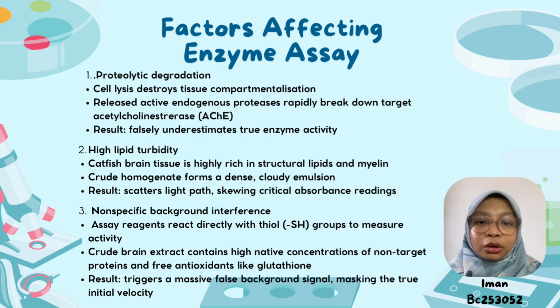First, we face proteolytic degradation. The moment we disrupt the catfish brain tissue, cellular compartmentalization is lost, releasing active endogenous proteases. These proteases will rapidly degrade our target acetylcholinesterase, leading to a false underestimation of its true activity.